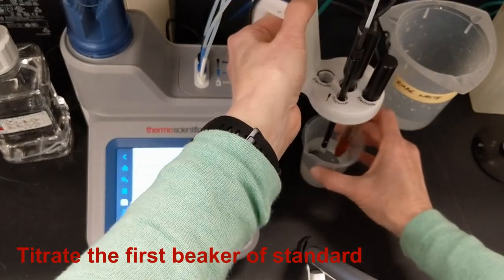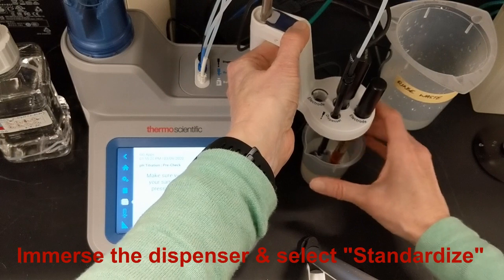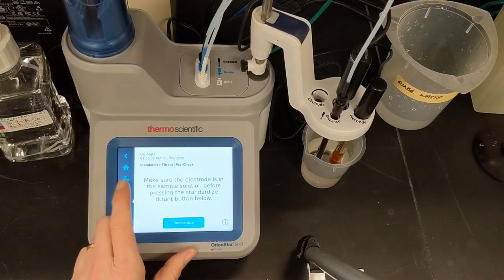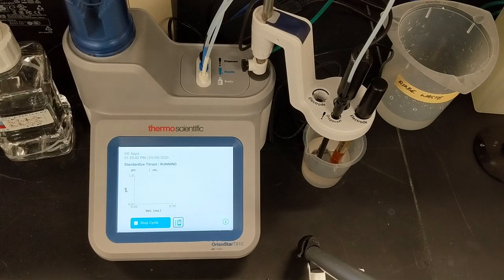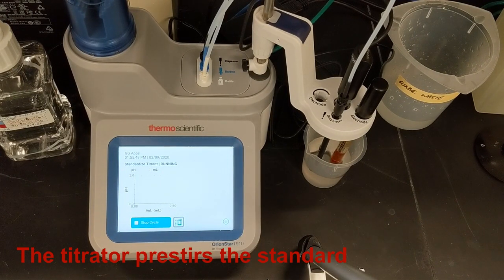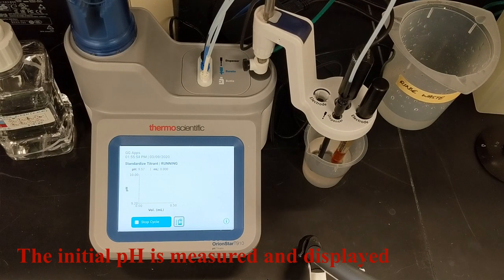Then I'll titrate the first beaker of standard. It's important to immerse the dispenser into the standard before starting. Then I select the standardize option from the titration pre-check screen. A live display of the titration appears on screen, showing the volume of the titrant which will be dispensed and the pH of the sample as the titration proceeds. The titrator begins a pre-stir and starts measuring pH. When the pH reading stabilizes, the initial pH of the standard is displayed.